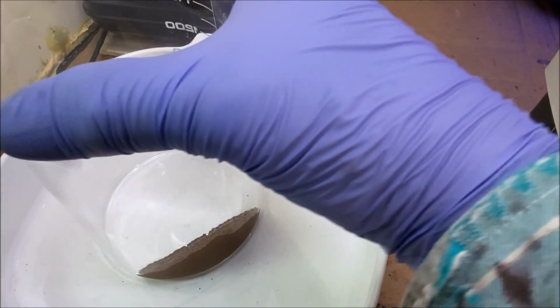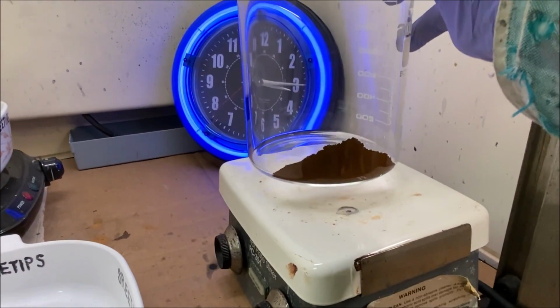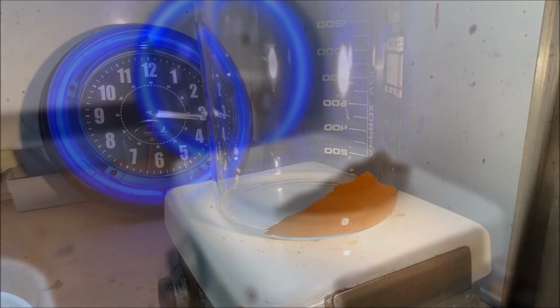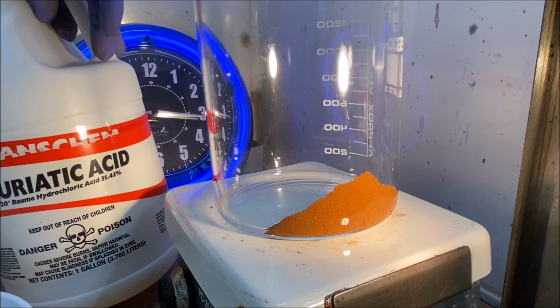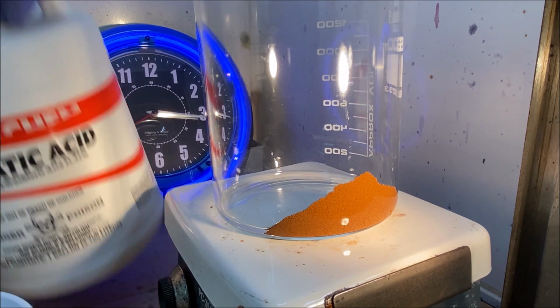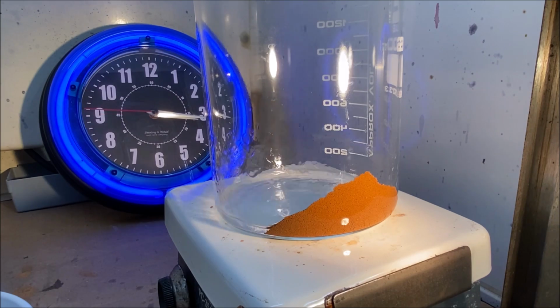Let's move our gold up onto our burner here. Get ready for the next evolution. What I'll do is add some hydrochloric acid to the gold up here on this heating pad, and we're going to go ahead and try to put this gold in solution a second time.